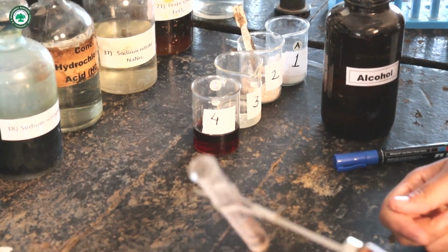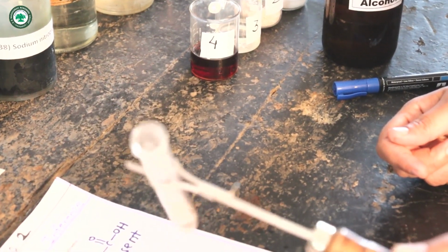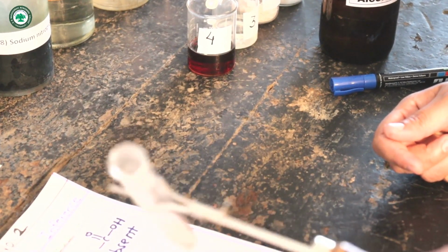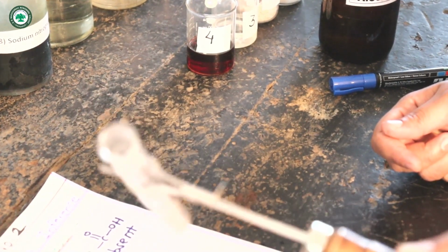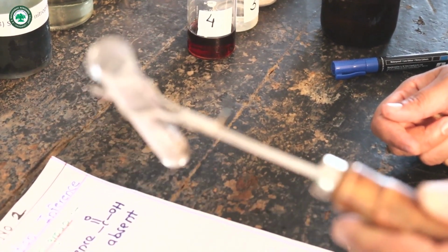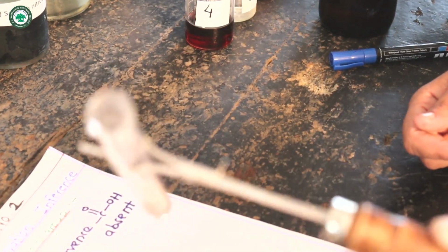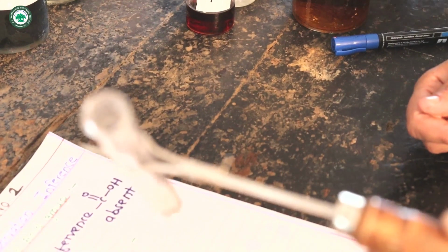Test tube holder, then shake the test tube. What is the observation? Compound second is soluble in alcohol.